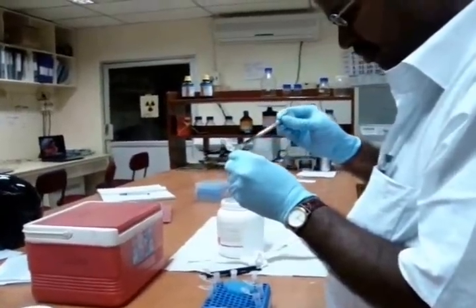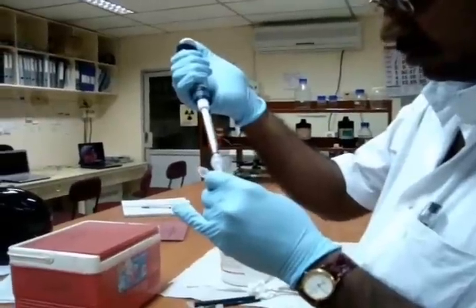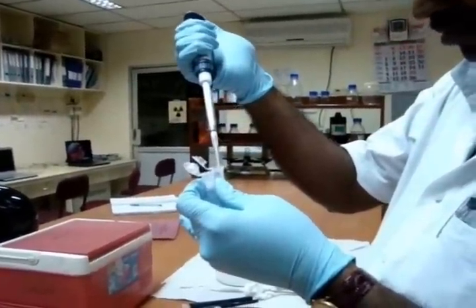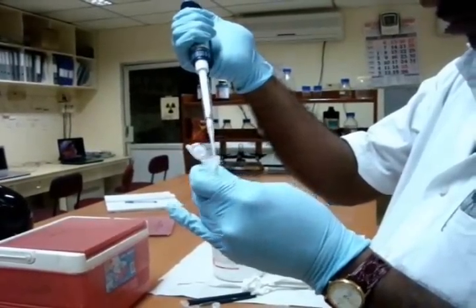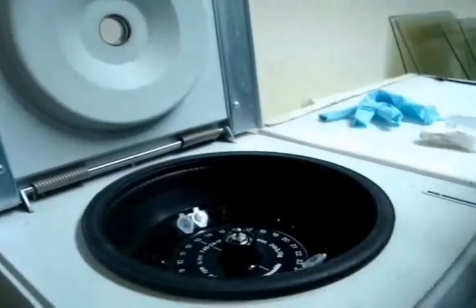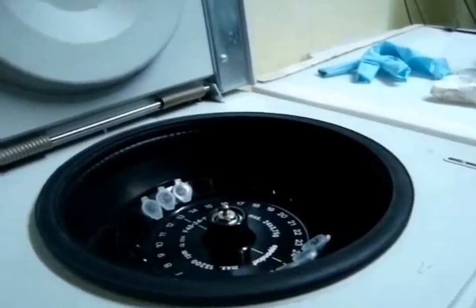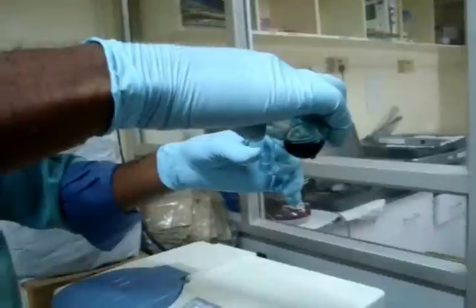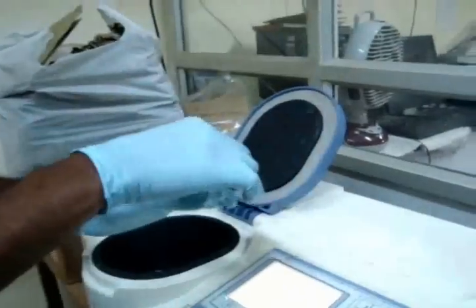The lyophilized sample powder is suspended in 200 µL of lysis buffer. The protein is then quantified using Bradford's assay.